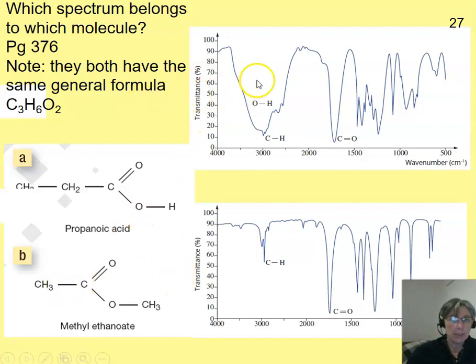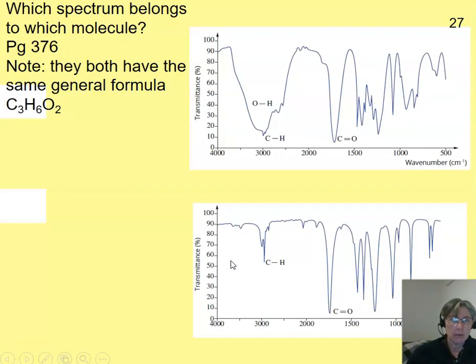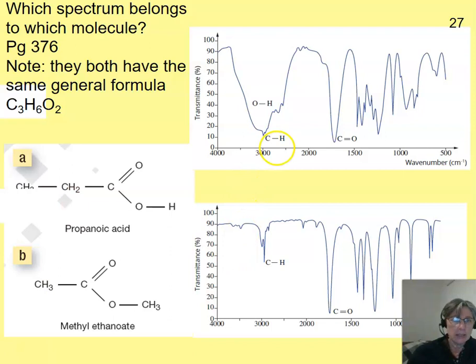Okay, so when you're looking, you can see we've got this broad peak here, which is missing from here. It's got the broad OH peak here.